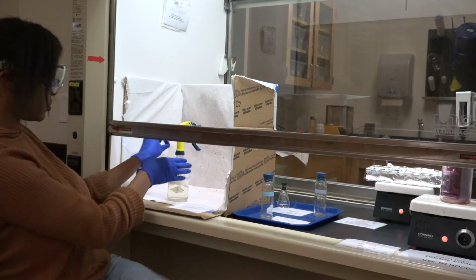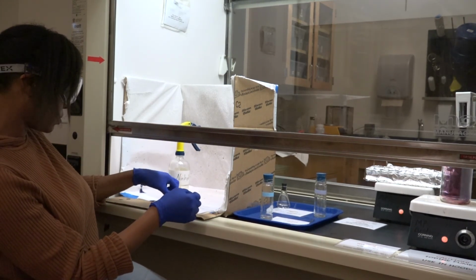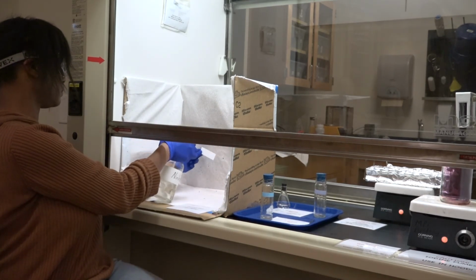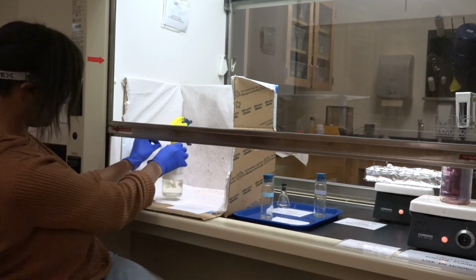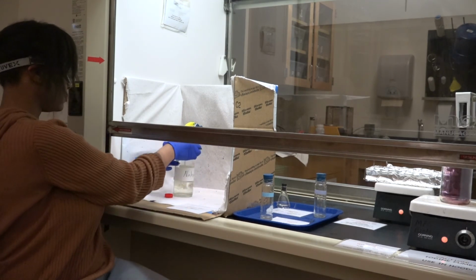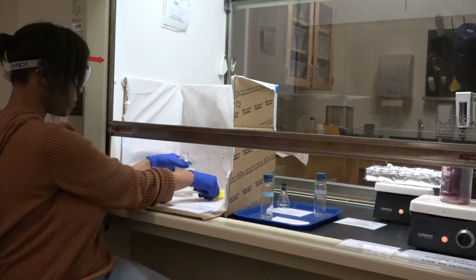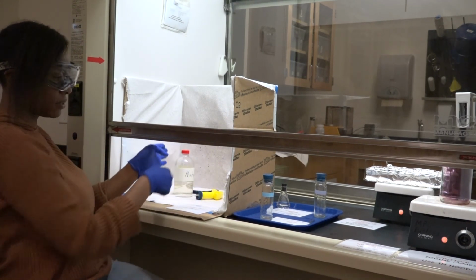And then we're going to let this dry again, and it should show. After it dries, we should be able to see our amino acid compounds. Alright. Good.